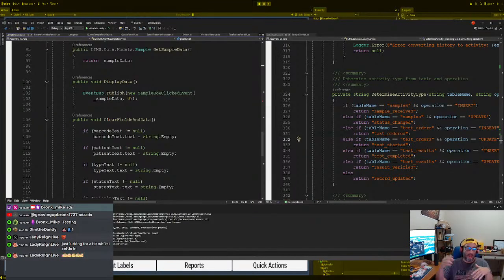So next time we'll come back and fix the filtering, the UI, and make sure all the bugs are fixed. You're always going to have bugs, but if you make it really simple, your job will be much simpler. Just remember, it's just a CRUD program. We are just sending and receiving data back and forth. That's all we're doing.